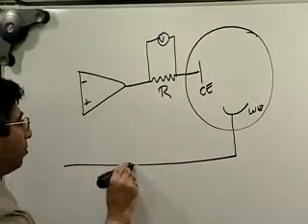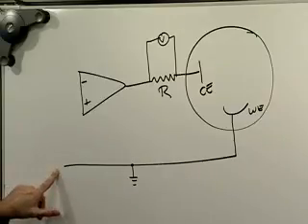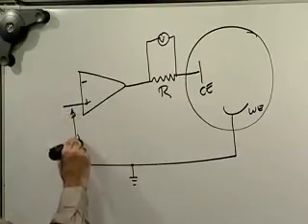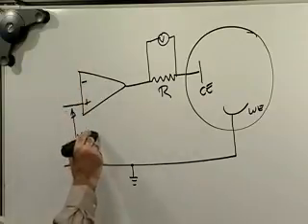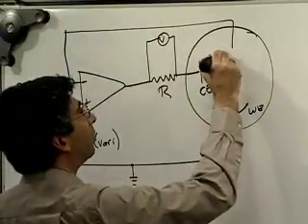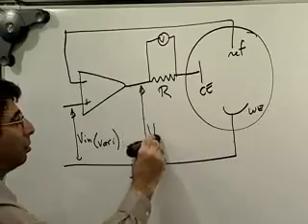This is somewhat counterintuitive, but most potentiostats, not all, ground the working electrode. You would think I'm trying to adjust the potential there, so why would I ground it? But we're talking about different zeros. So typically, certainly in your PAR type of potentiostat, you ground the working electrode. And the way we're then going to adjust this whole thing is by applying a variable V in here. Let me just write that that's variable. We can adjust that. And then on our second input lead, we'll just take it around to the reference electrode. So we have a V in over there, and we have a V out over here.